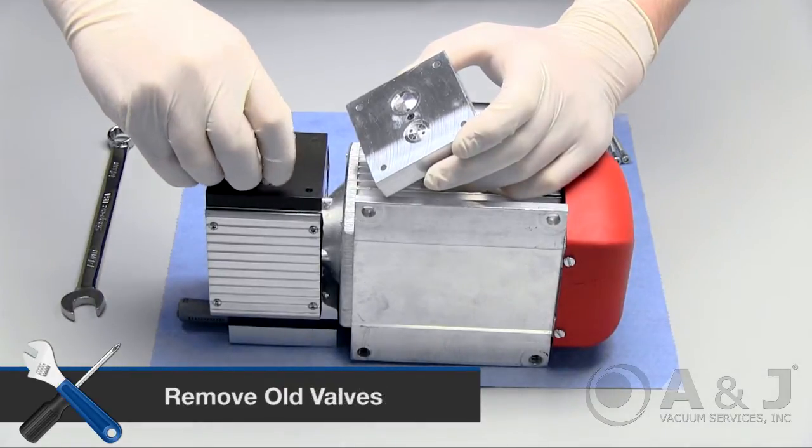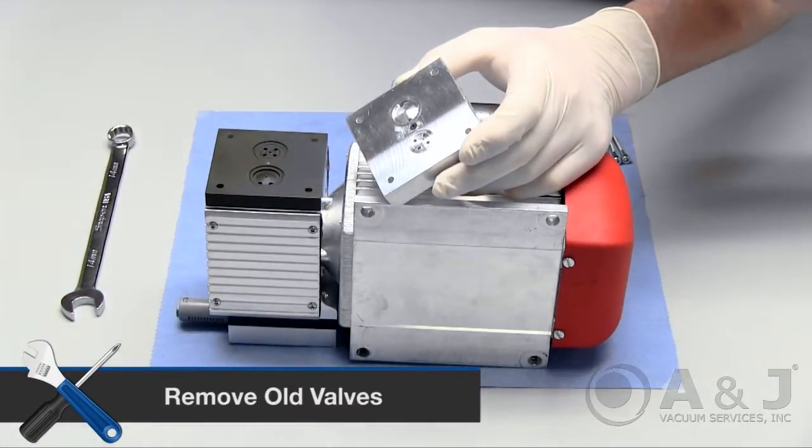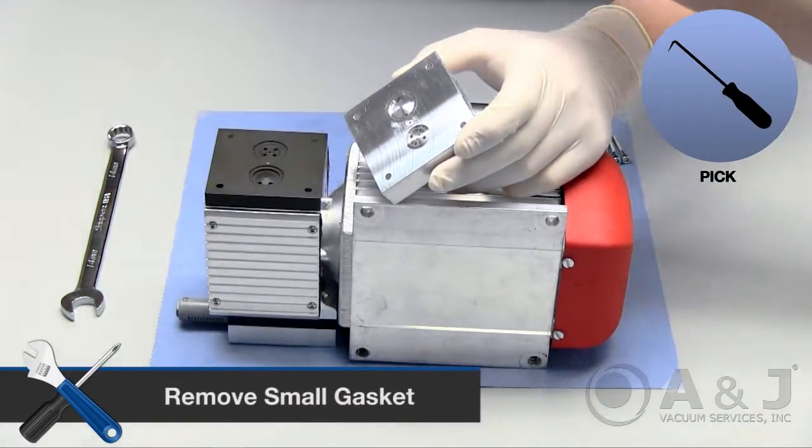Continue to remove valves from the intermediate plate. Use a pick to remove the very small gasket in the middle and put off to the side.